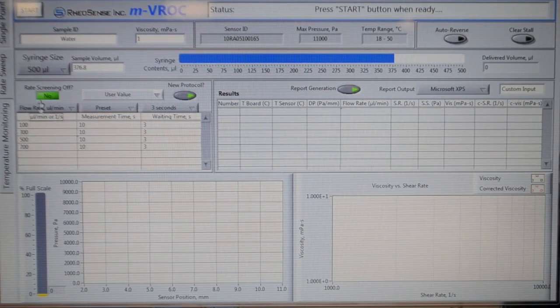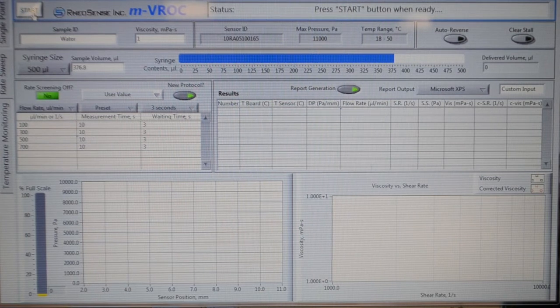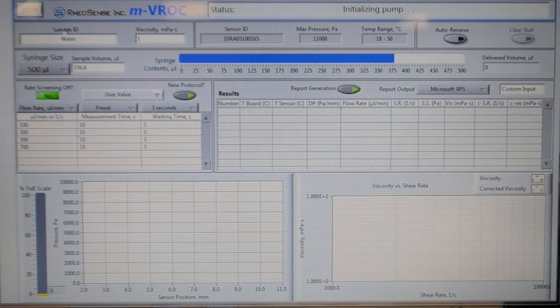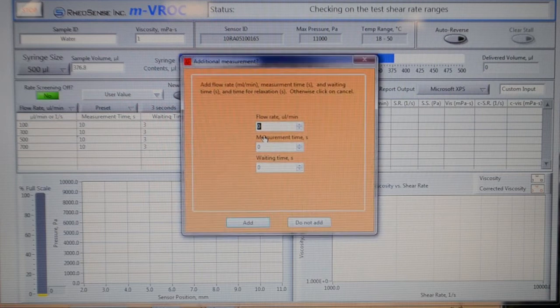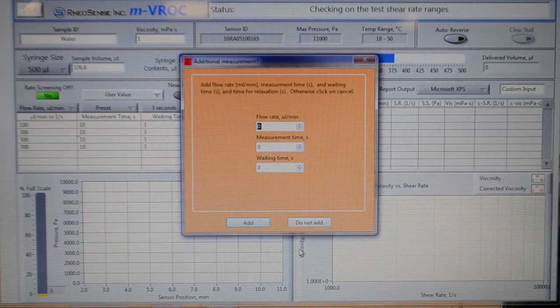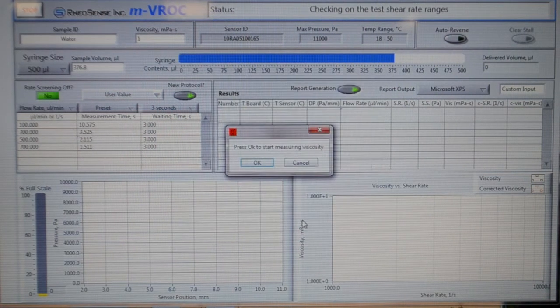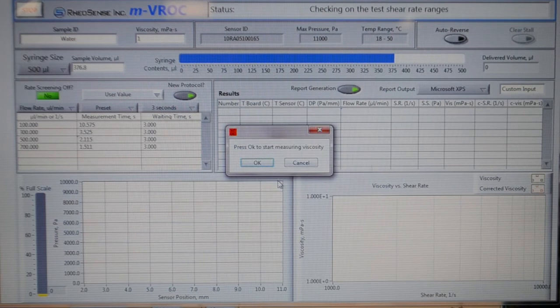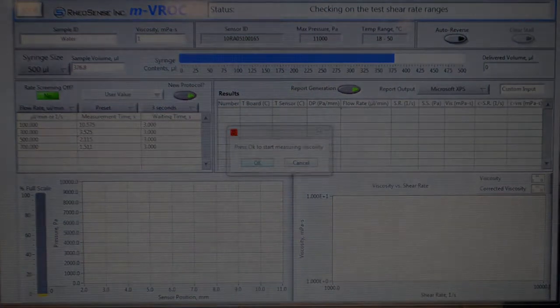Click Start. Add any additional flow rates you want to measure, and click OK to start measuring viscosity.